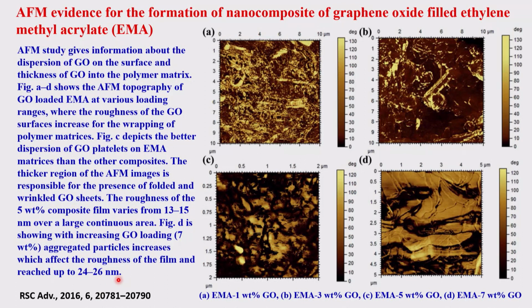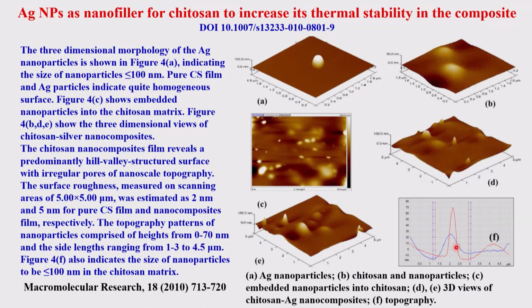So therefore, this will not serve the purpose of making it, and this also gave a huge amount of roughness in this. So that's how the AFM helps a lot in these things. Further properties can be studied, etc.